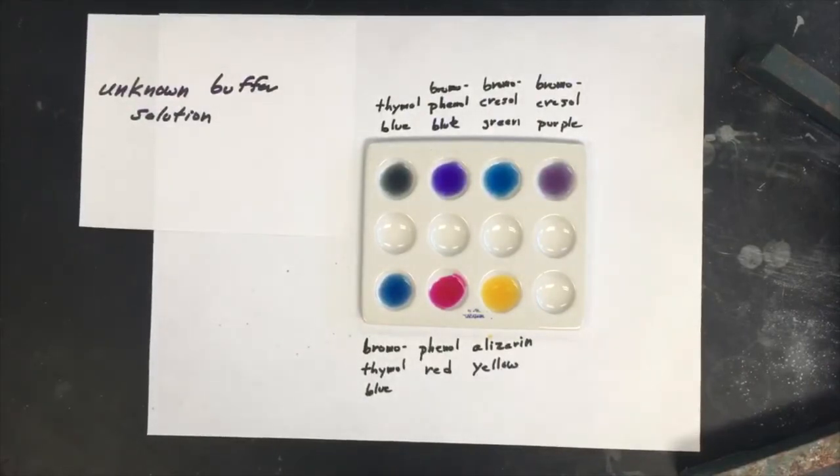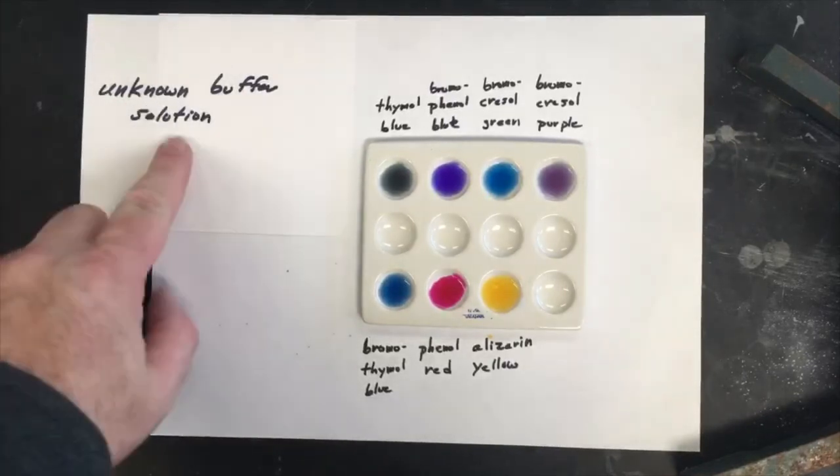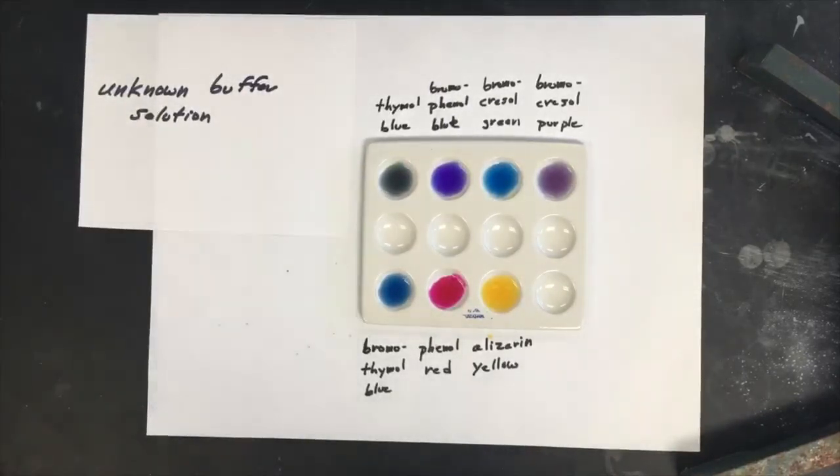Here's the last solution that we're going to try to determine the pH of using indicators. It's an unknown buffer solution. You don't have to determine what the buffer is, but need to estimate what the pH of the buffer solution is based off of the colors in these indicators.